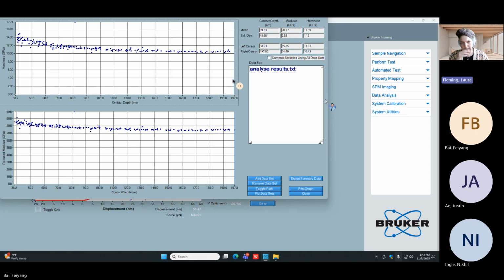So yeah, the data just went through and opened up every curve, clicked execute fit, and it gave us the fit, and the hardness and modulus are all saved in this file. Each one of these points is then each individual indent's hardness and reduced modulus. I have two questions here. My first question is, are these results what we expect? And do I care if they are or not?